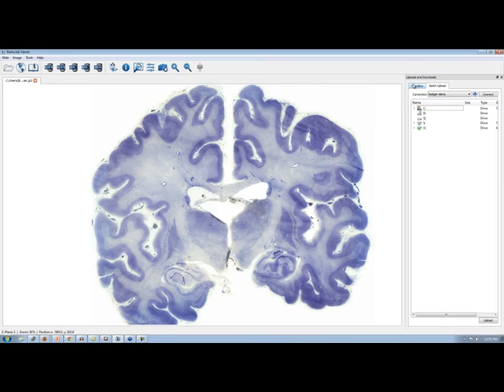They may already have a large number of images on their local drive that they're going to want to upload. Instead of sitting here and uploading one at a time, I can batch upload a whole folder, go back to the bench, finish my PCR, come back, and hopefully they'll all be uploaded. Exactly, and actually as they're uploading, you can go to the Transfers tab here, and this will list the status of all of your uploads and downloads, and you can cancel them if you need to as you see fit, or add new ones in.